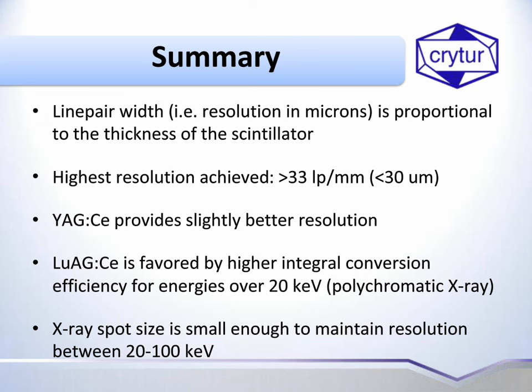How is the light output of the scintillator related to the X-ray radiation flux? Well, if you have higher flux, you have higher scintillating effect, and there's a linear correlation. So the higher the flux, the higher the scintillating output will be.